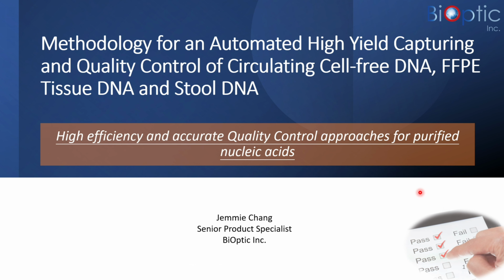Hello everyone, thank you for joining us today. After Alex's impressive presentation, we will go into the second section of this webinar. In this section, I will introduce to you high efficiency and accurate quality control methods for various nucleic acids, including cell-free DNA, FFPE DNA, stool DNA, and total RNA. I'm Jemmie from BiOptic.